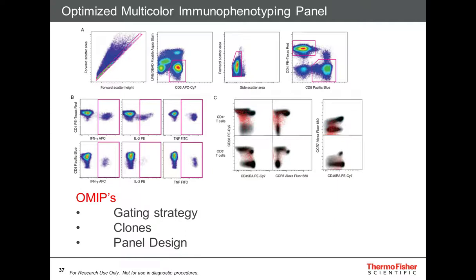But there is a lot of help out there. The flow cytometry community is really, really collaborative, and OMIPs were introduced by the reviewers of the journal Cytometry. So I think there are more than 50 now. These are open source, and they were designed because no matter where you publish a paper, you can never get all the information that you need from the journal's methods section.